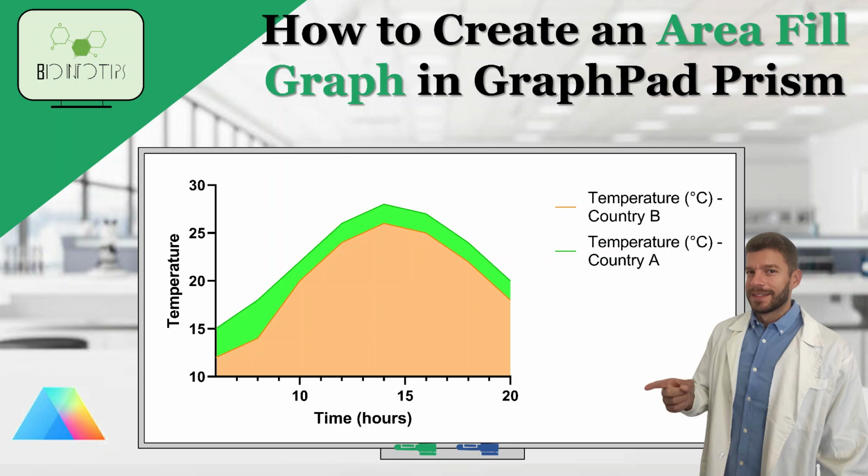Do you want to know how to make an area fill chart on GraphPad Prism? You came to the right place.